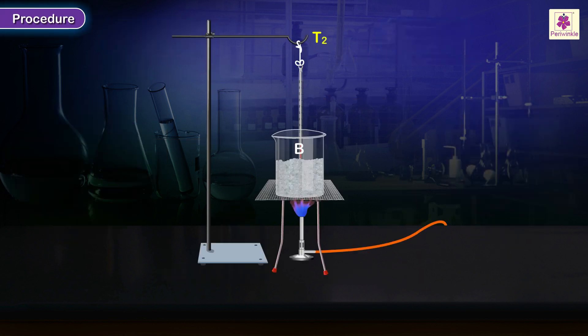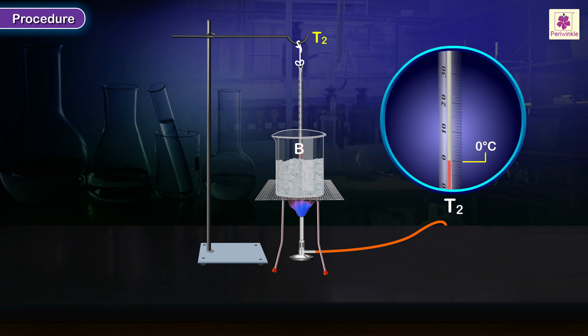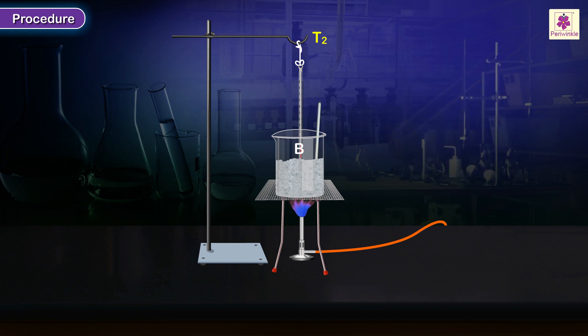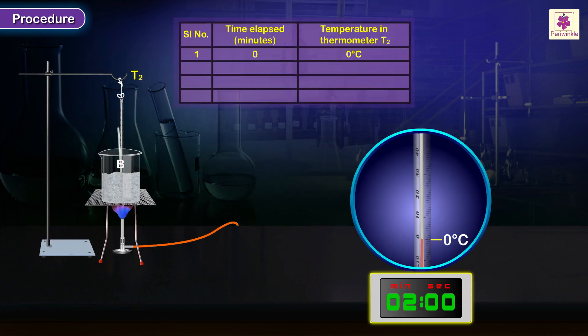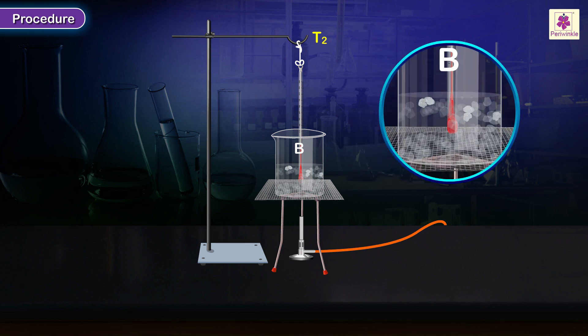Procedure. Gently heat beaker B when T2 shows 0 degrees Celsius. Gently stir the ice using another clean glass rod. Read and note the temperature once every two minutes. Stop heating beaker B when only a small quantity of ice remains unmelted in it.